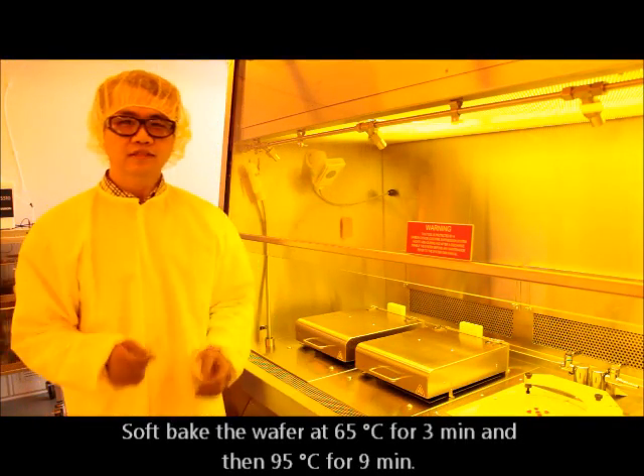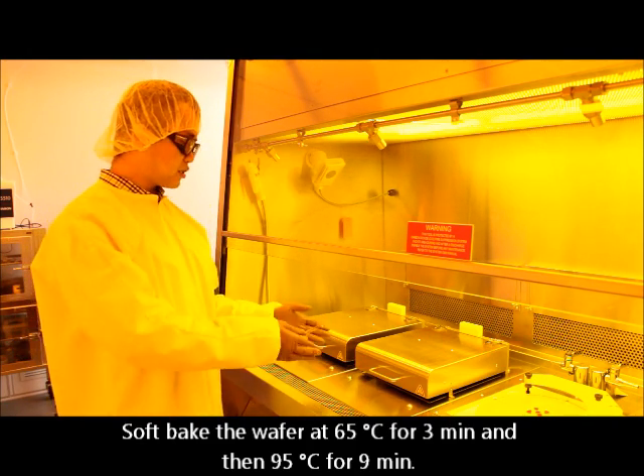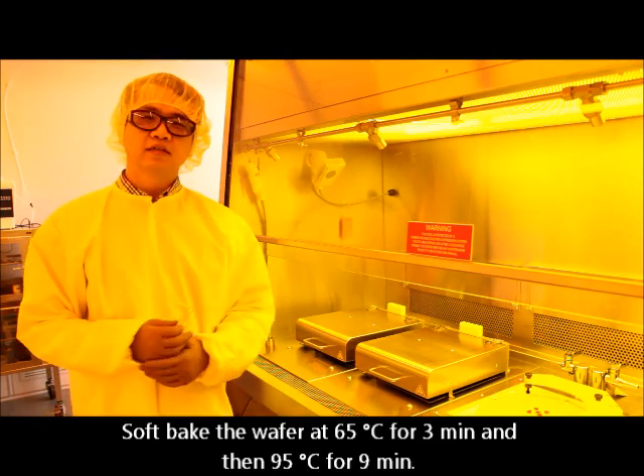The next step is to soft-bake the wafer at two temperatures: 65 and 90 degrees Celsius.